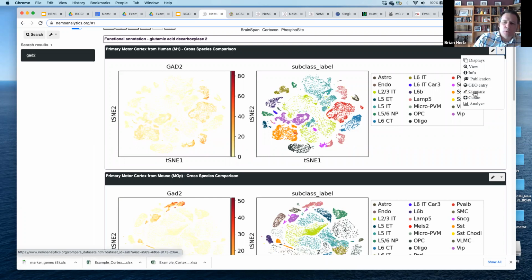The compare tool, I showed you a little bit about that in the presentation. So you can take a very superficial gene expression difference between any two of your cell types. So that's a dedicated tool for just finding broad gene expression differences between established classes within your data.